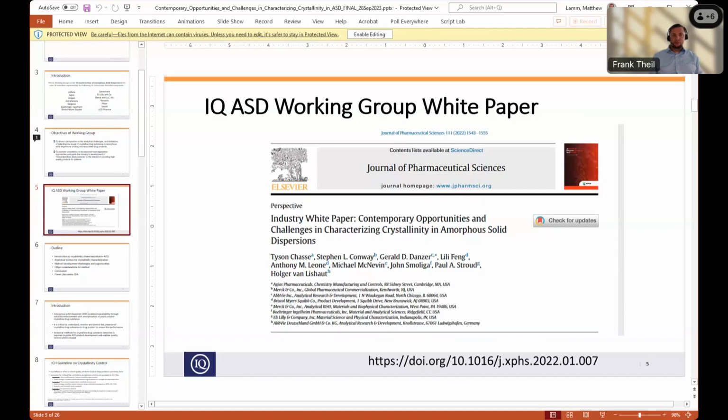Instruments usually operate with their own chemometric suite in the software that they are running with, or they might have a different chemometric engine than where you did your method development. And this can lead to difficulties when you want to transfer a method that you have developed on a bigger chemometrics package to an instrument software package, as certain pre-processing routines will not be available, or areas are truncated differently and will lead to slightly different results.